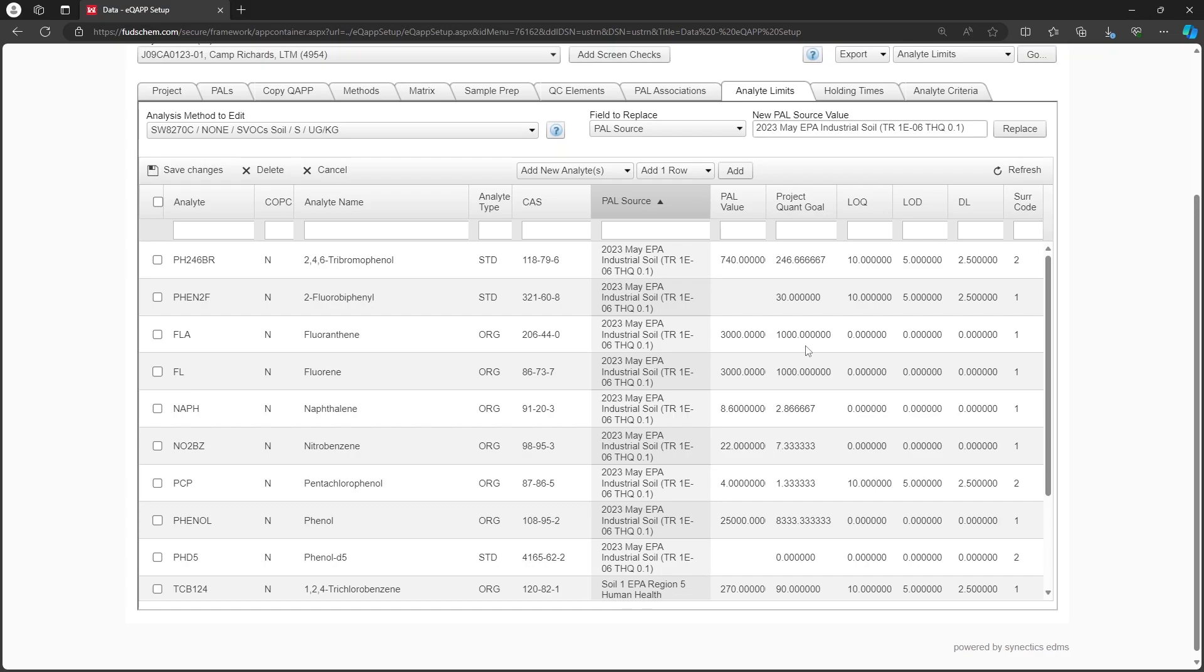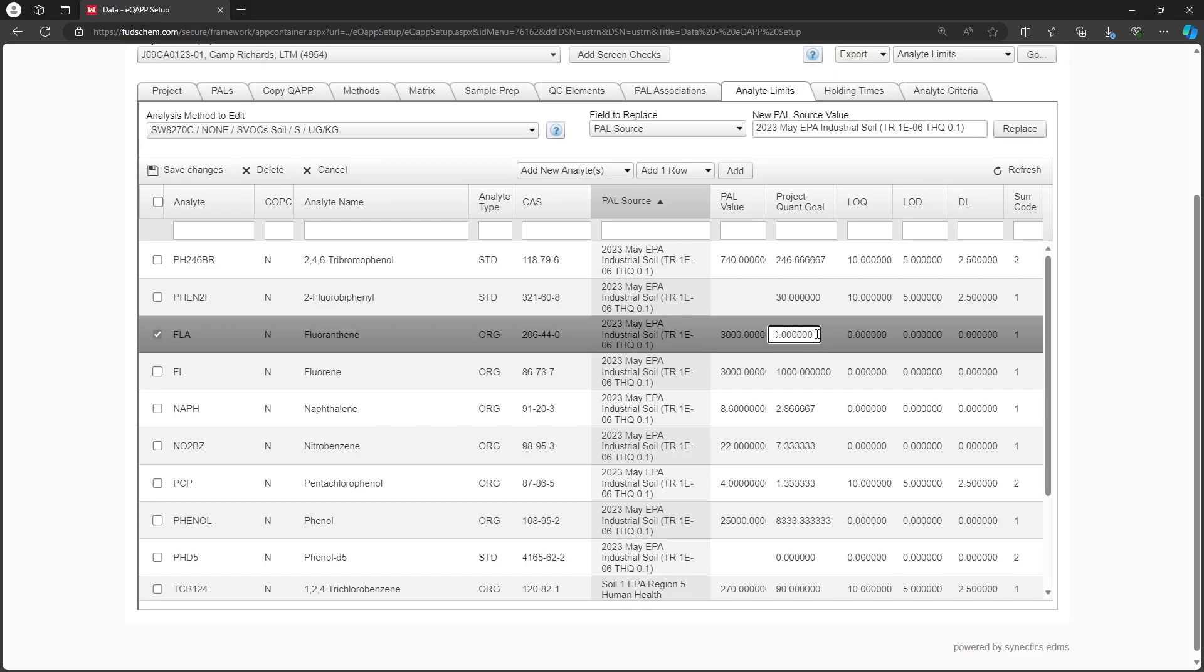The project quant goal column can also be edited by typing into the cells or using the field to replace option.